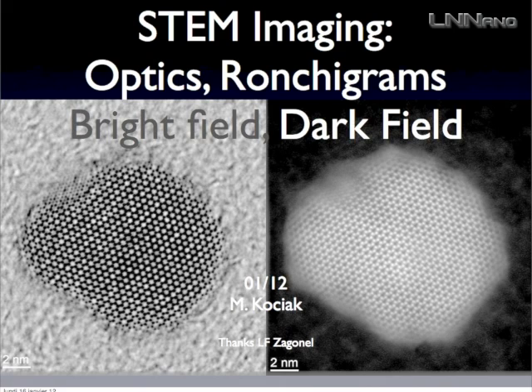And it's very important because in all these points, especially when you use spectroscopy, you can make a direct link between the structure and the electronic, optical, chemical properties of your sample. It's very important, and it's not because this is atomically resolved that it's interesting. It's interesting per se. Okay.